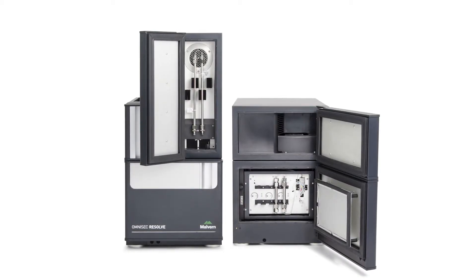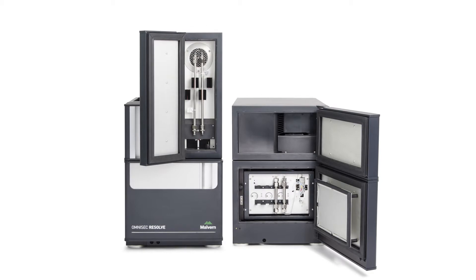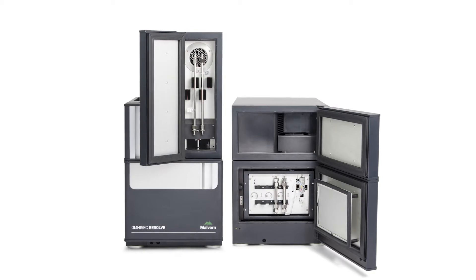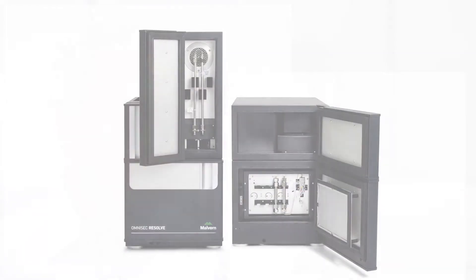Well, what makes the OmniSec system unique is really that it was designed from the ground up to be a dedicated size exclusion chromatography system. And two of the key improvements or enhancements that come along with it are really the sensitivity of the light scattering detector as the first.